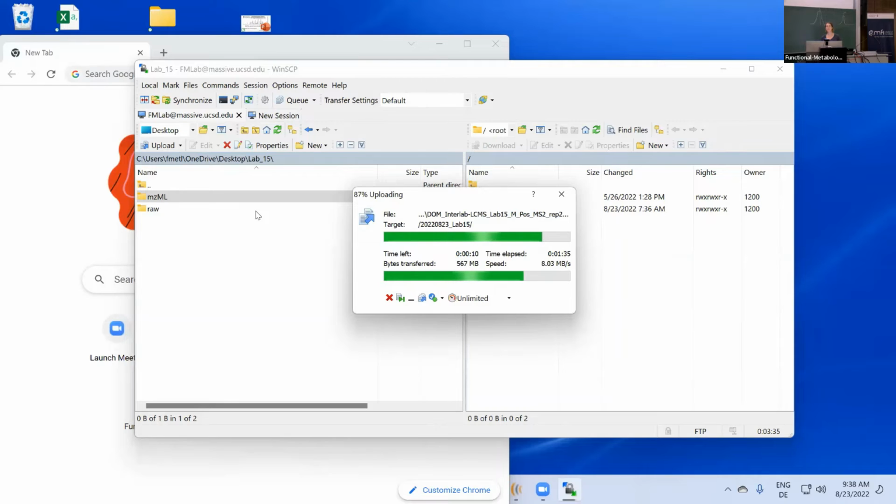Yeah. So how long do they actually store the data on the database? Is there a policy that they say, okay, they store it for 10 years or something like that? Yeah, I think they store it indefinitely. Yeah. So once it's too much, right? Like I can use it as all my data there, so I know.